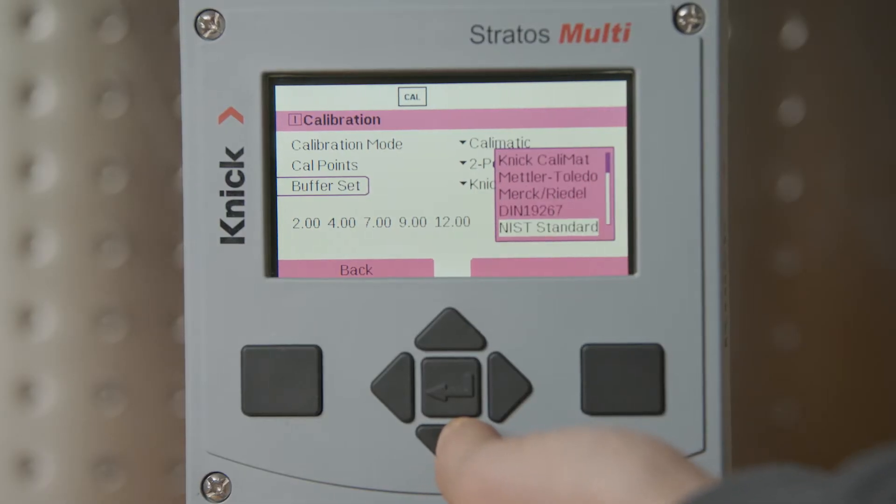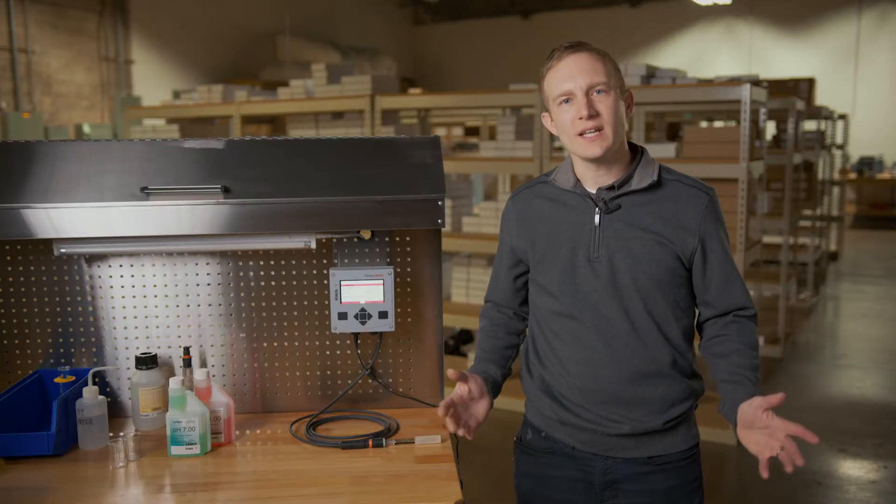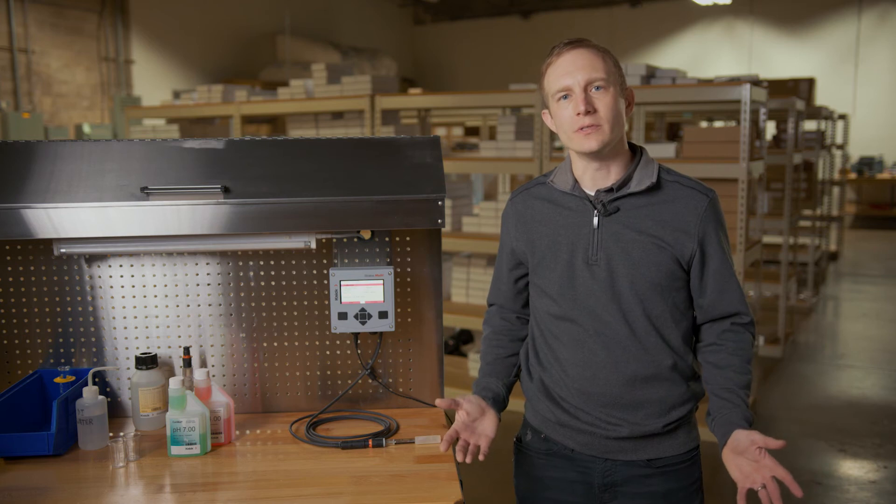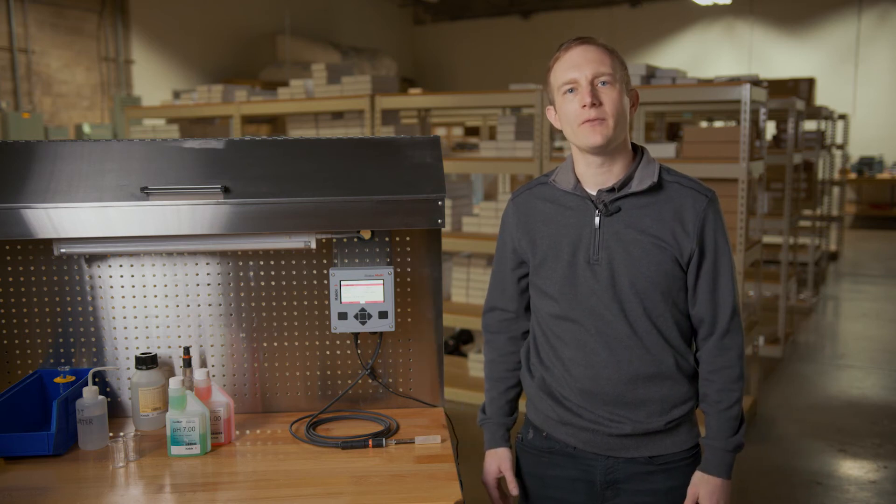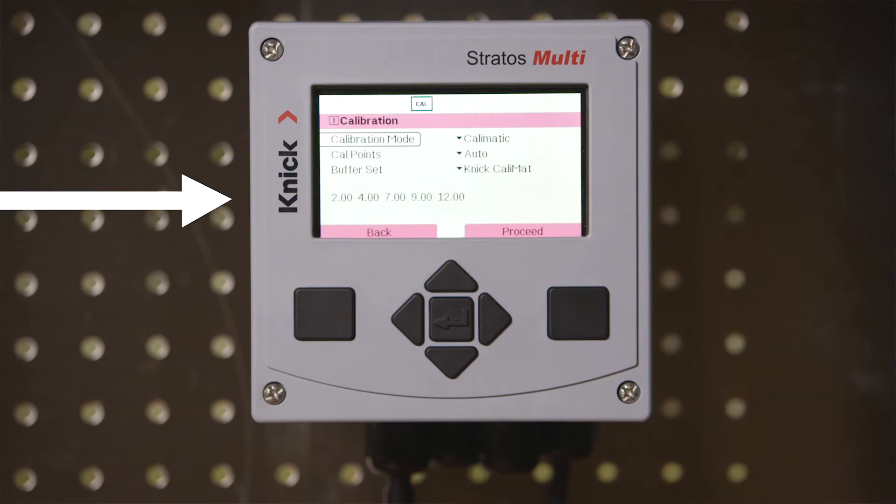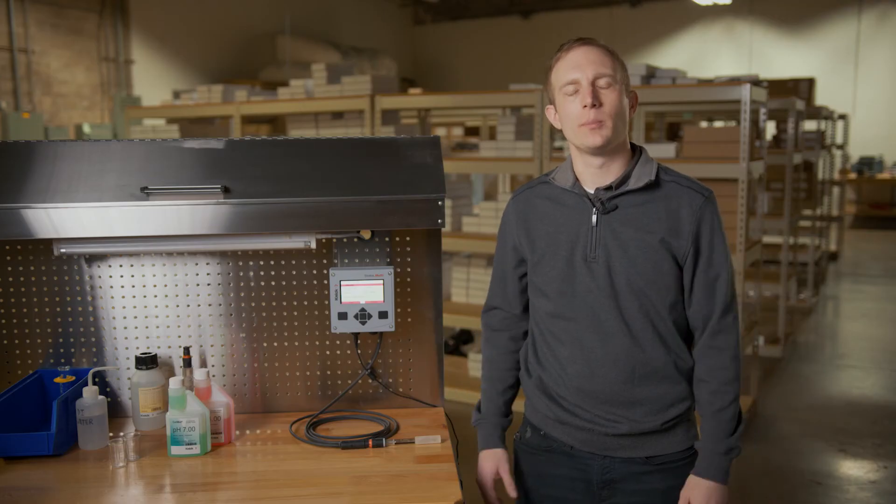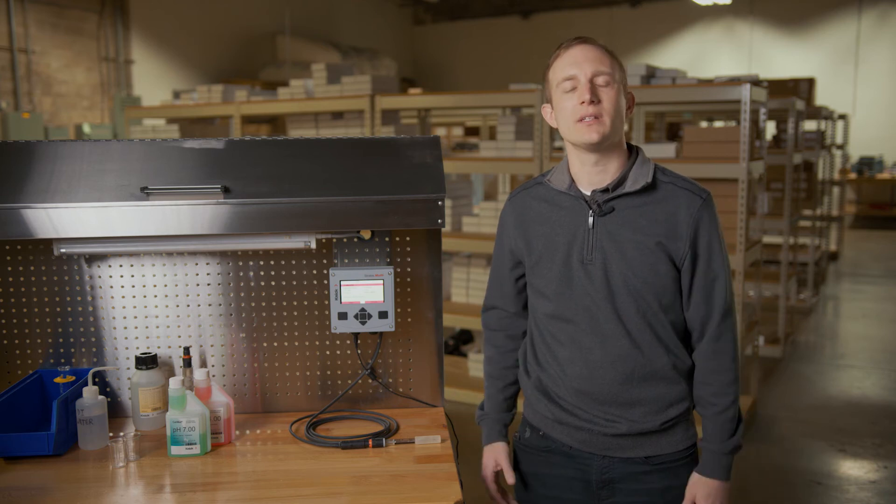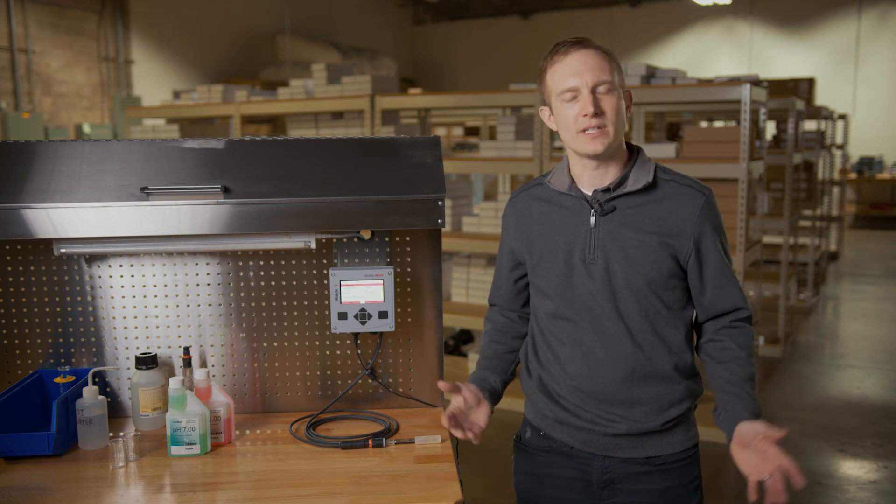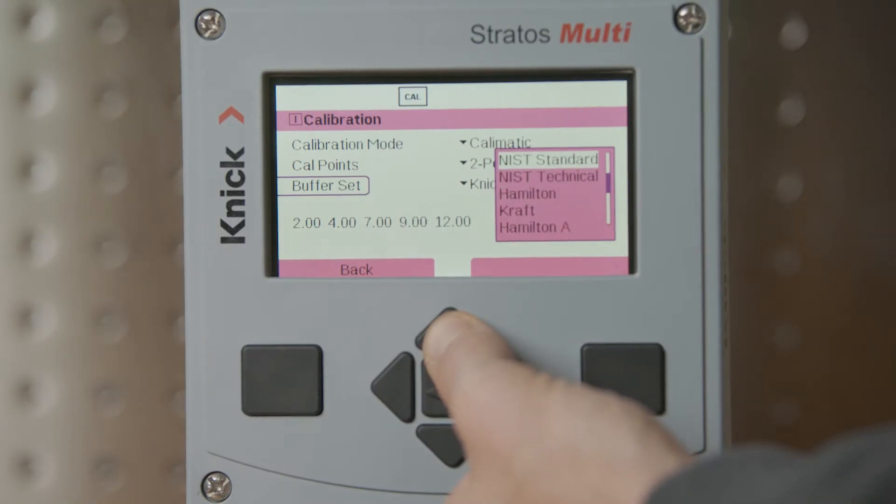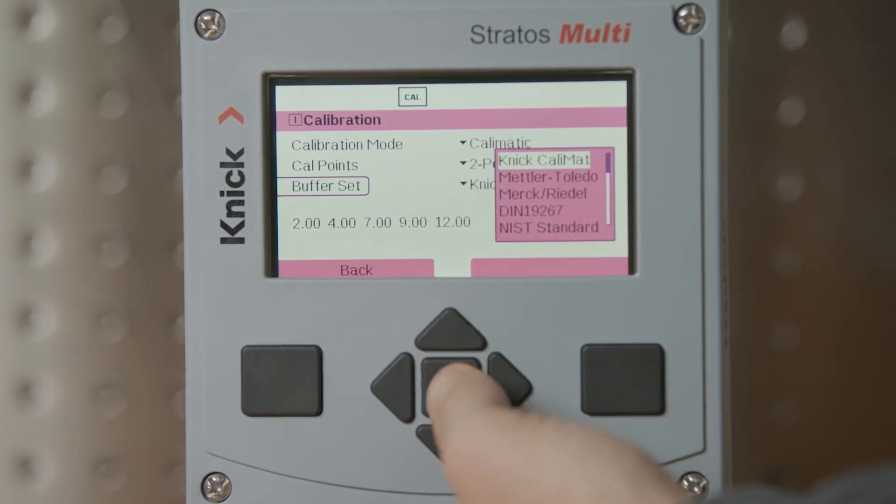The Multi has numerous buffer tables stored within its software for selection by the operator. It is important to note that NIST technical is most commonly used, however verification of your buffer values should be cross-checked against the values displayed at the bottom of the screen. A nice feature which is also available for selection is the ability to select a user-defined buffer table. We will select the Kinnick Calimat buffers and press enter to continue.